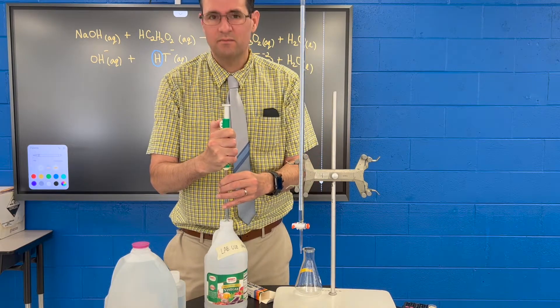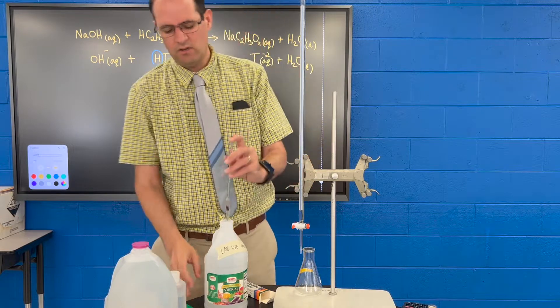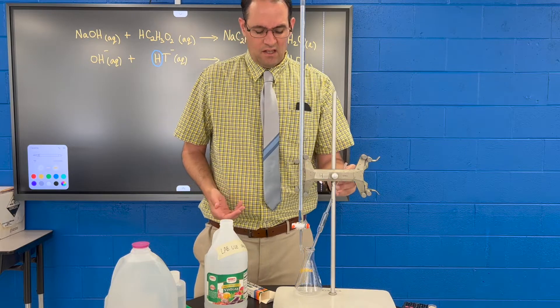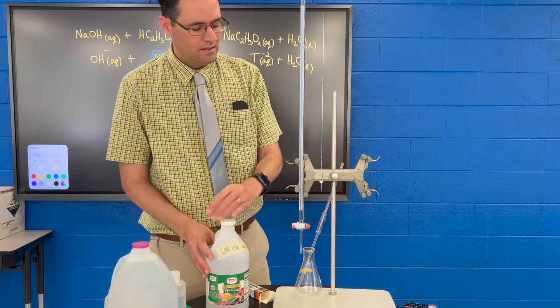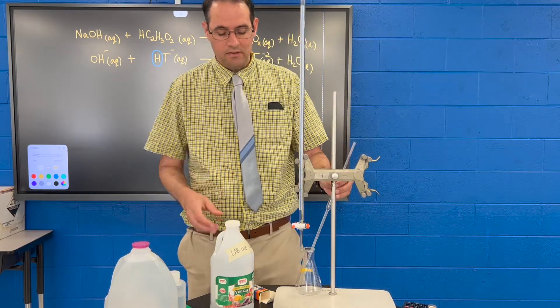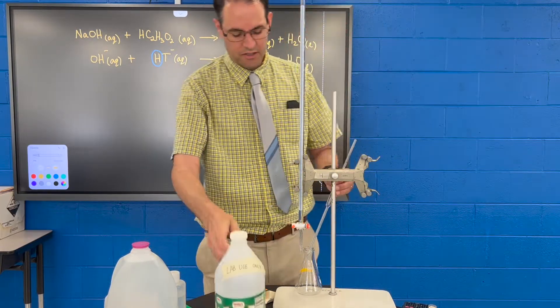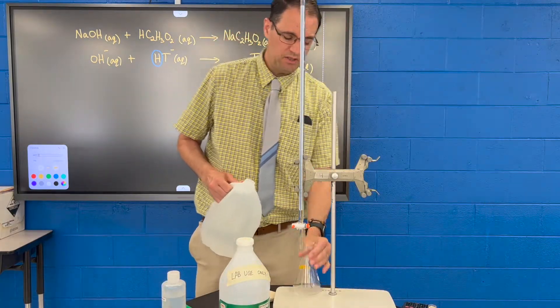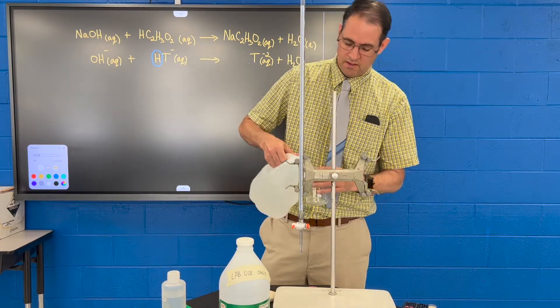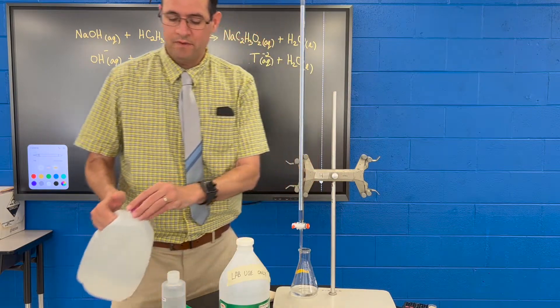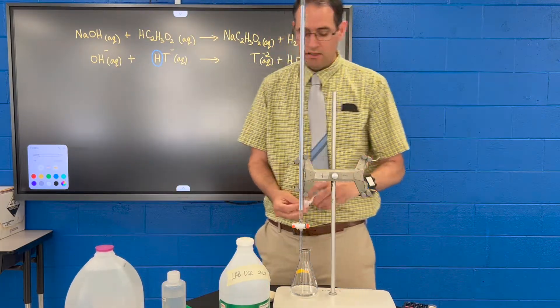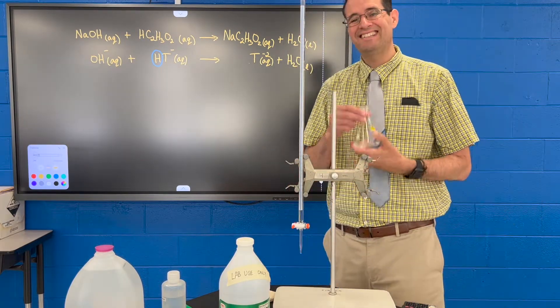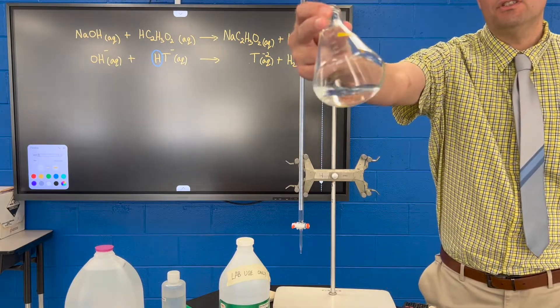So I'm gonna do this very quickly here without really measuring things out too well, just so we can get some visualization and have an idea what's going on. So maybe this is like four milliliters of the acetic acid dispensing in there - it smells nice, it smells like vinegar. This is standard household vinegar. We're going to add a little bit of water. The purpose of this is just to dilute the solution a little bit so we have more to work with. The phenolphthalein won't be as intense.